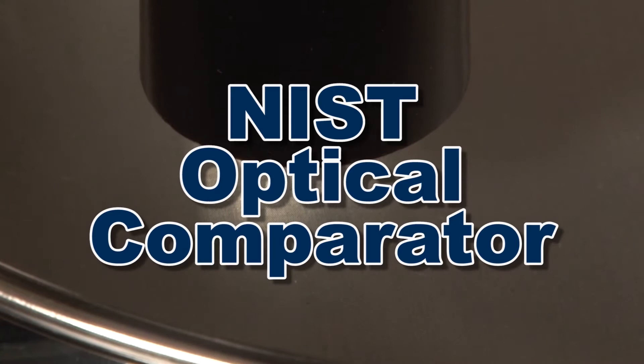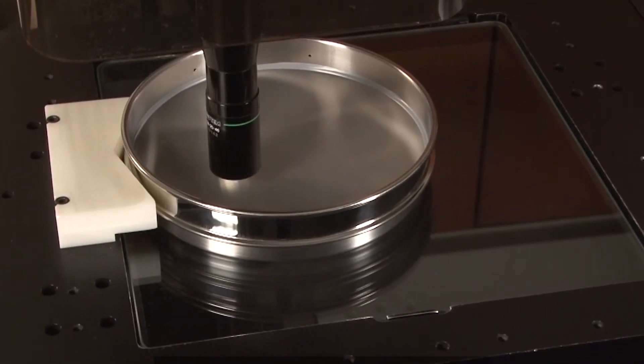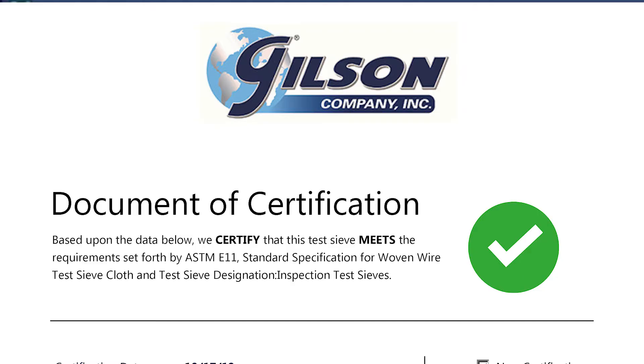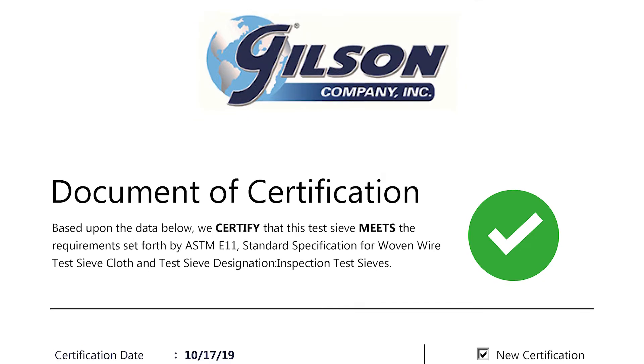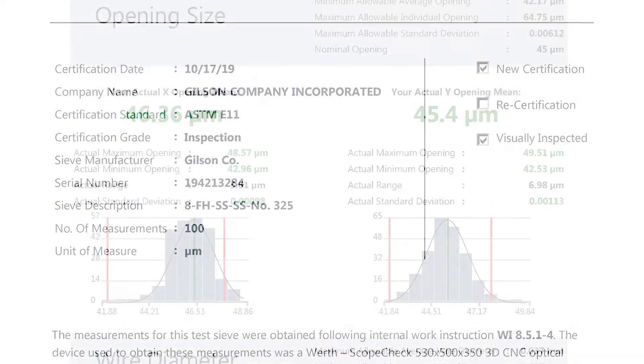This computerized system will scan your test sieve or screen tray, perform a statistical analysis, and provide a verification report to assure that your test sieve or screen tray meets an inspection grade or a calibration grade rating.